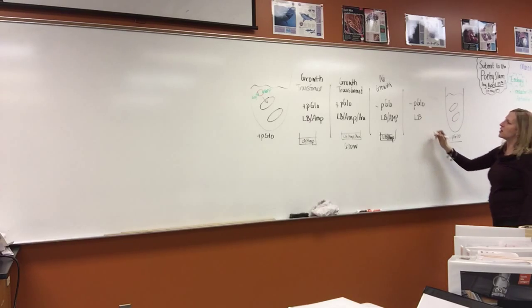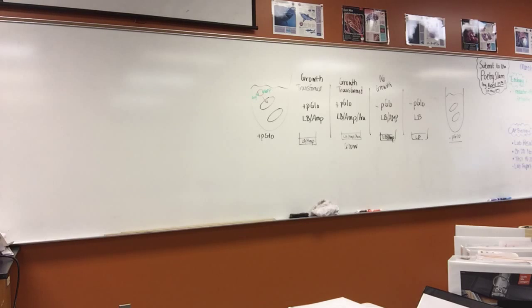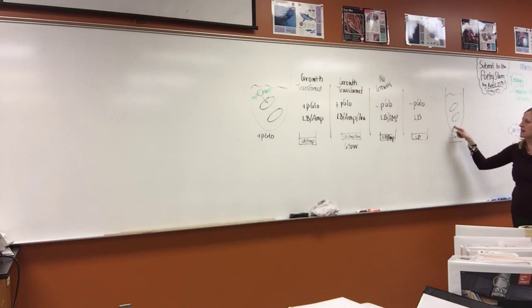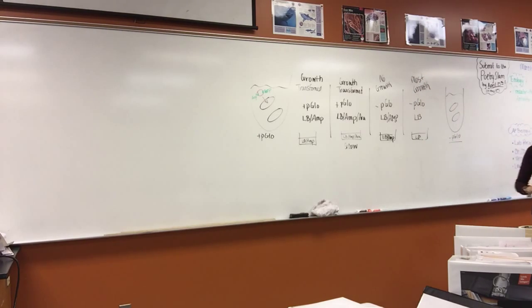Then this plate just has food for the bacteria. So now you put 100 microliters on here. Is there anything that's going to kill these bacteria? No. This one right here, you should have the most growth, and the growth should be so much that you can't even count the colonies.